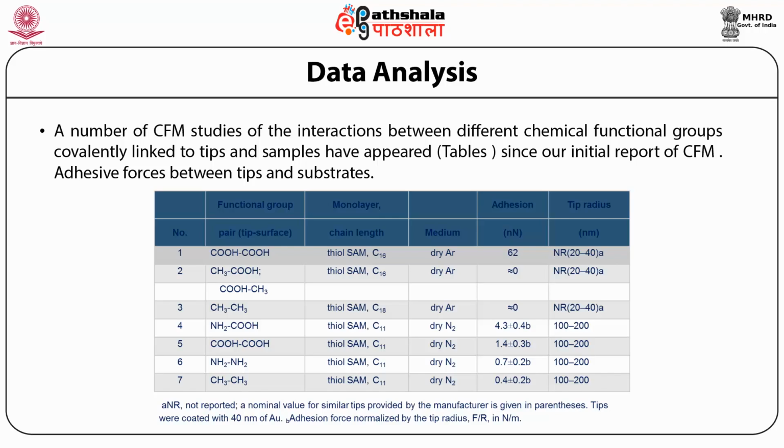Adhesive forces between tip and substrate will ultimately determine the data given in the table.